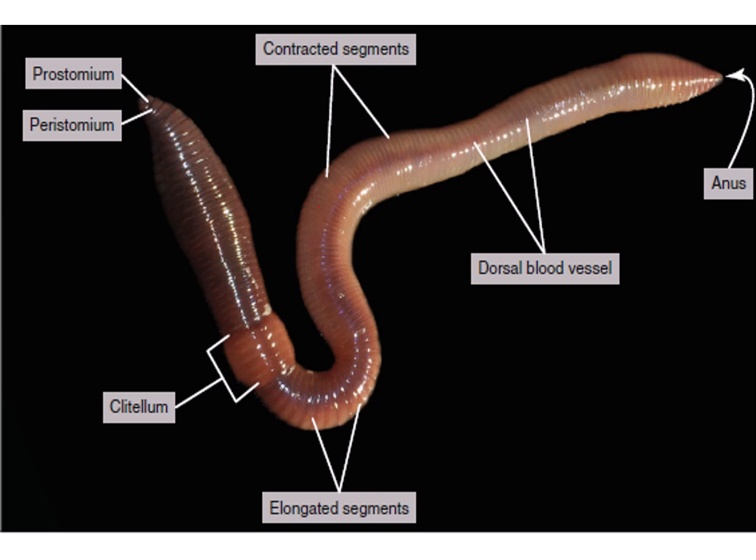The ventral side is flatter and lighter in color. On the dorsal side we can see a prominent blood vessel that is darker than the rest of the dorsal side, and it is called the dorsal blood vessel. There could be blood vessels present on the ventral side, but the ventral side is lighter, as we know.